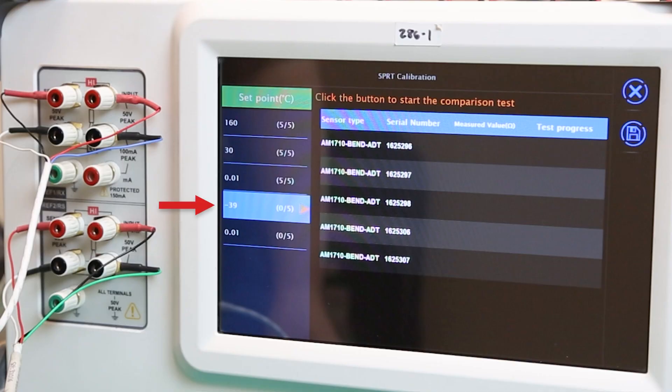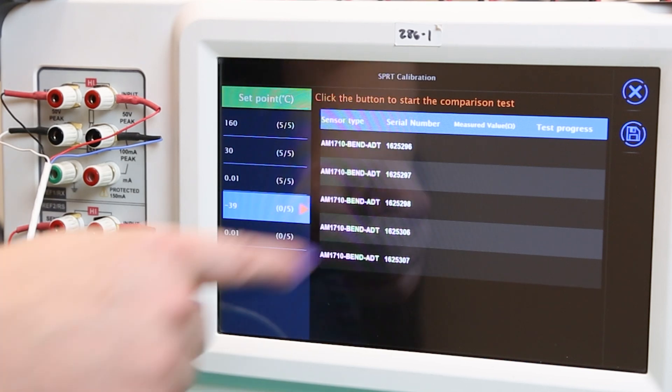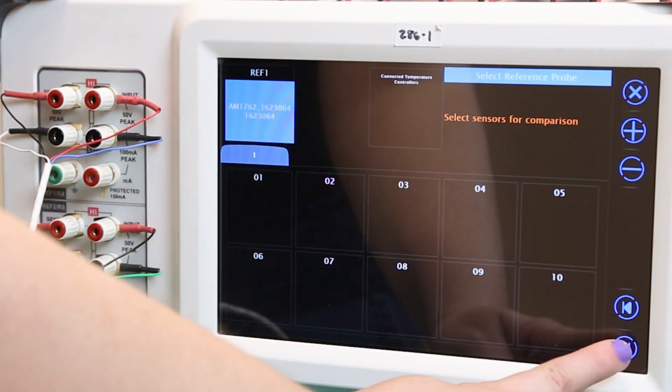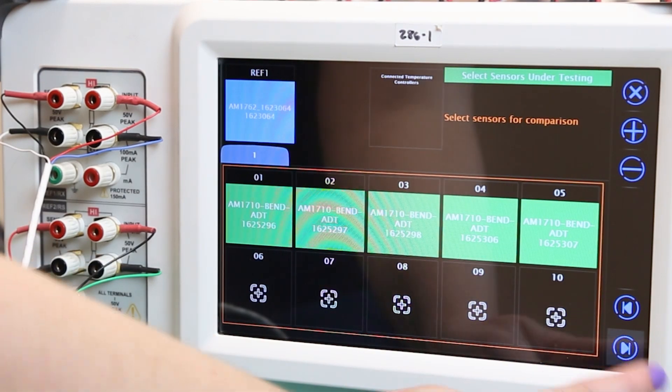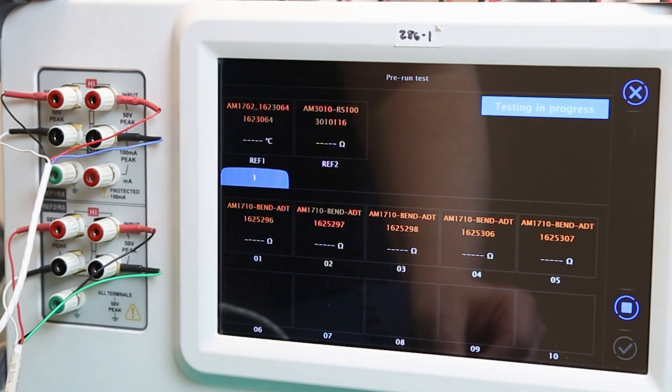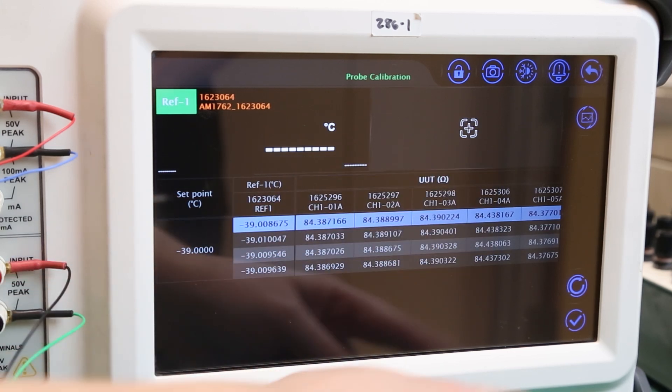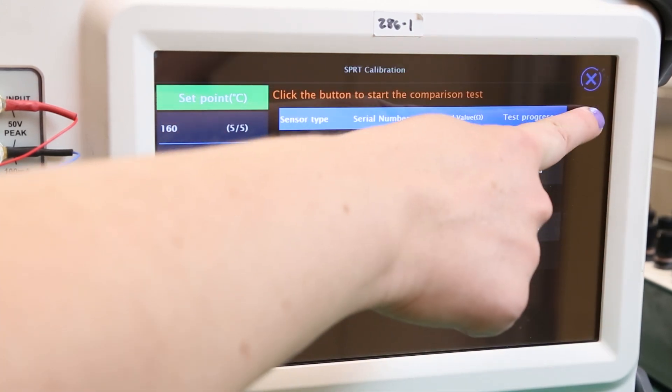Select the negative 39 degree calibration point on the left hand side of the screen, select the first probe, and again add all of the probes to their corresponding locations on the device. After pressing play, the test will complete automatically just like the last two comparison measurements. Save the test cache by selecting the save icon in the main calibration screen.